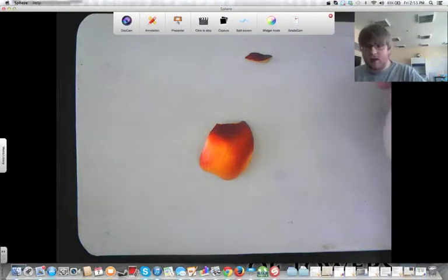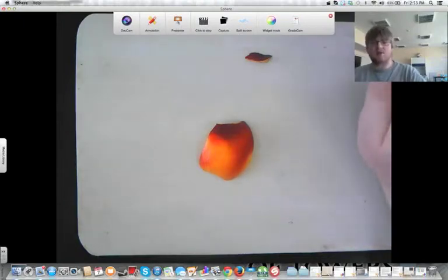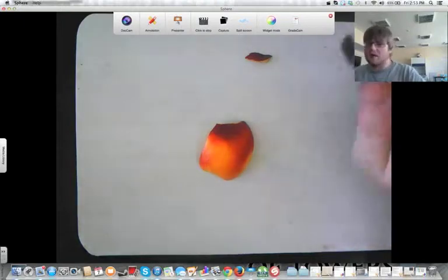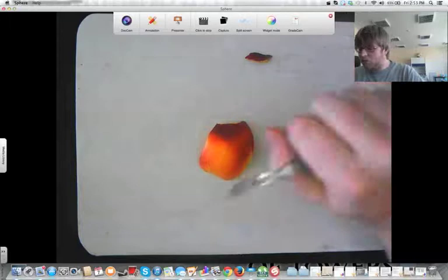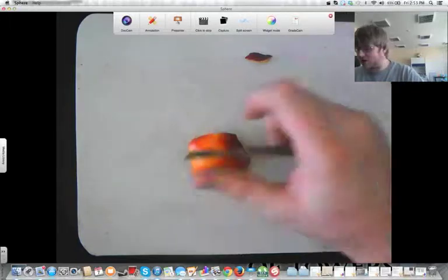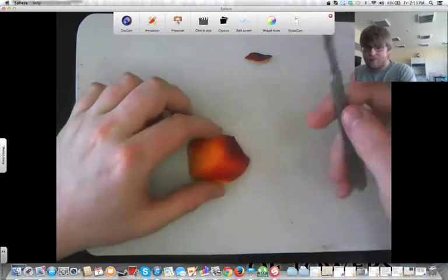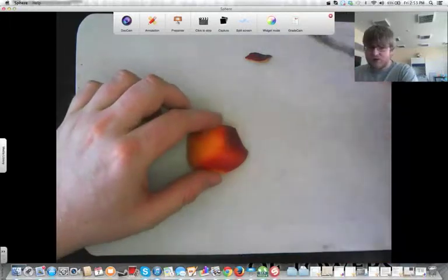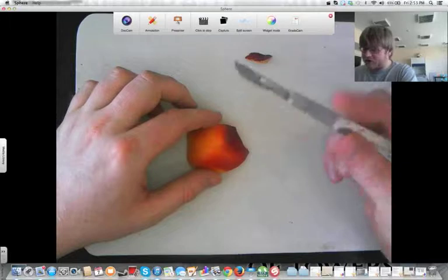It's not a knife. What it is, is it's a precise opening tool. It's not actually for cutting. So what you want to do, I've made the first little bit here, but you want to make smooth, long incisions.